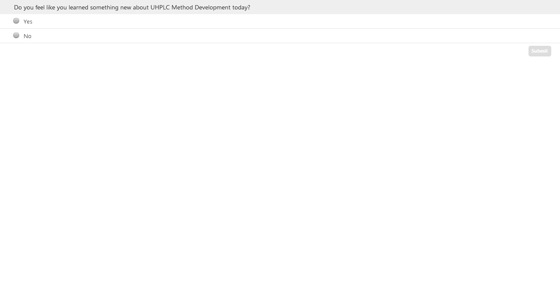I think we'll do just one last question, and that is, how do you handle step gradient translations? Does the calculator do that as well? Yes, I did mention some aspects of that. It will translate based on a correction factor, so a conversion factor for each of the steps within the gradient. So yes, the answer to that question is you can use the translator, no problem, for any number of steps. And also, if there's not enough boxes there, we can always add more boxes to the steps. It's an easy thing to add.